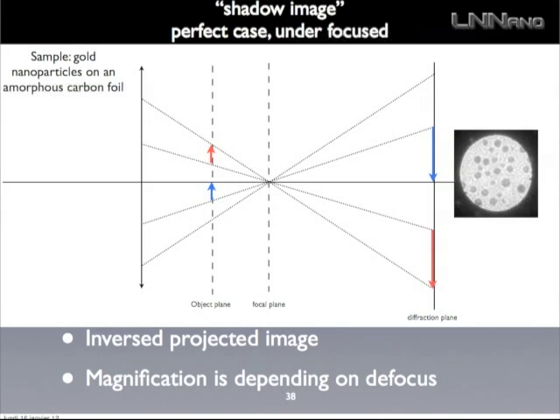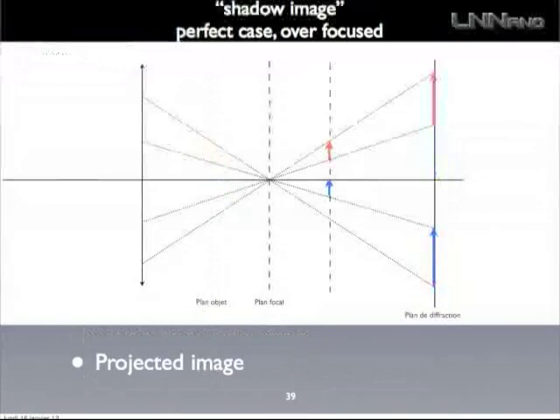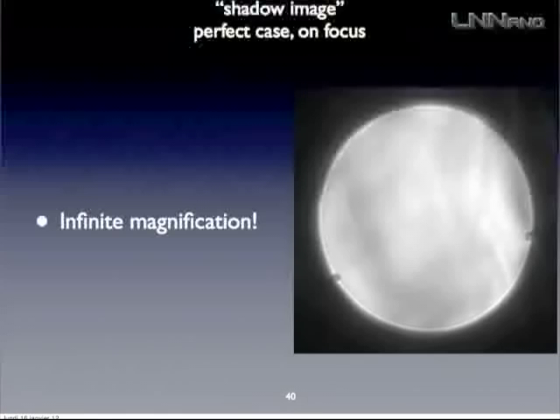But if you want to very quickly survey an image, okay, this is exactly the same but over focus, so not a lot of importance. If you are exactly on focus and you look at what is inside your Ronchigram, there is absolutely nothing. It's flat. It has to be a totally flat contrast. There are small defects because we are in real life, but it's almost flat.